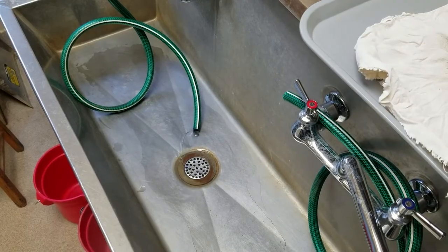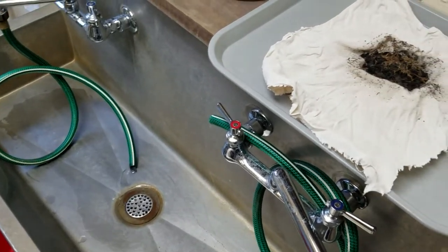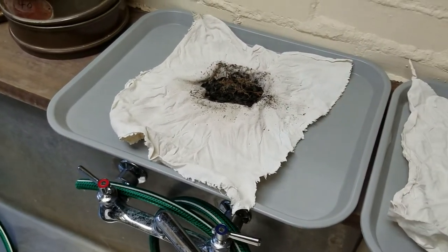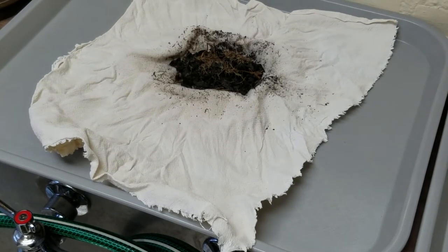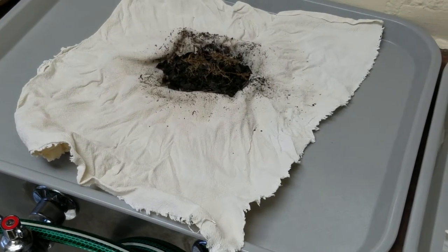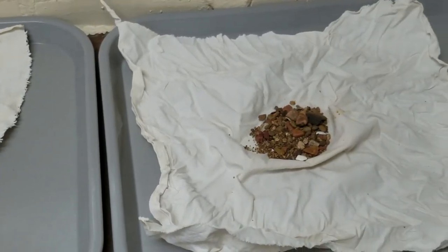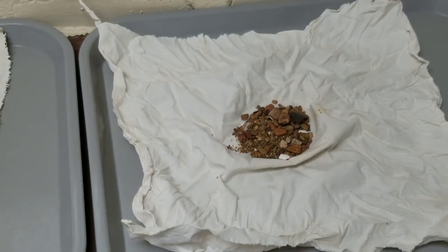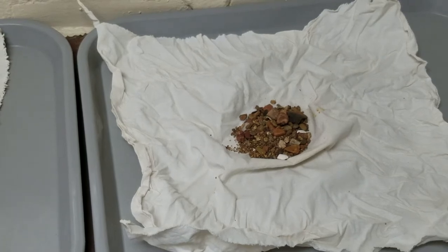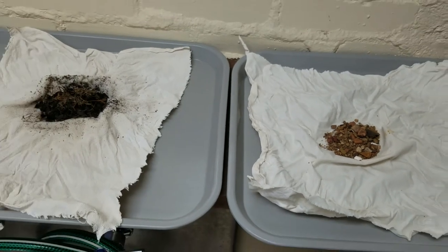With flotation, a soil sample is first dried and then immersed in water. The light organic material, mostly charred plant remains, floats to the top and is poured off and collected. This light floating material is called the light fraction. Whatever sinks to the bottom — the heavy fraction — can include leftover sand and rock, as well as pottery and stone artifacts, bone, and shell. Light or heavy, these small remains can provide important information on the site.